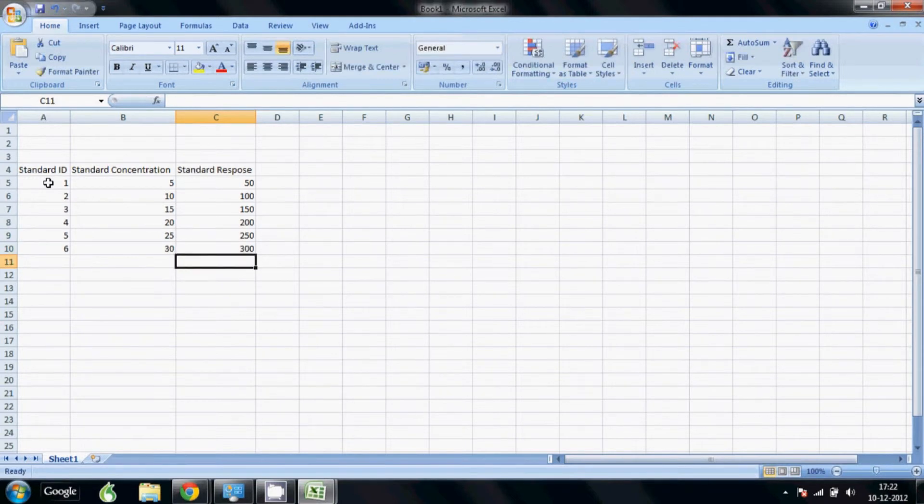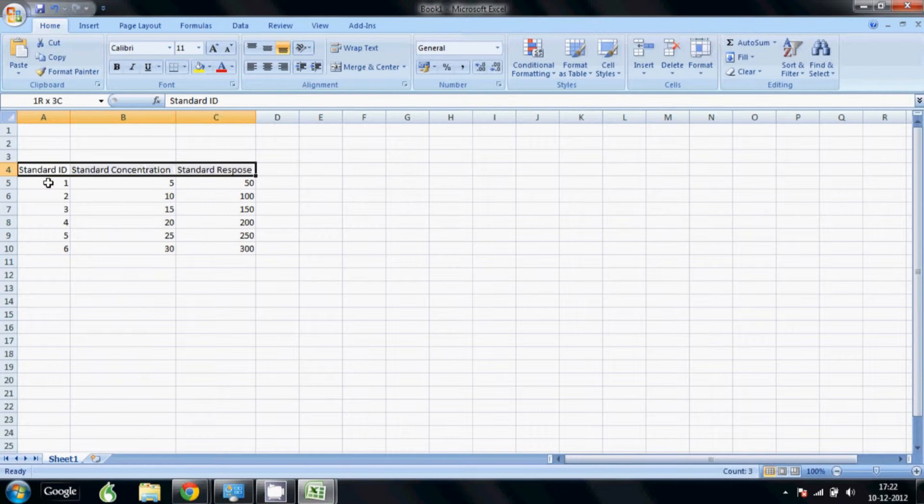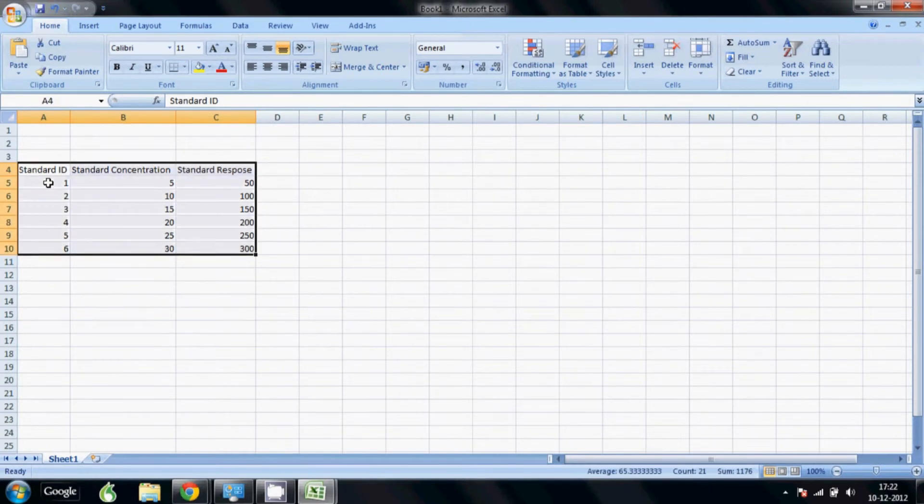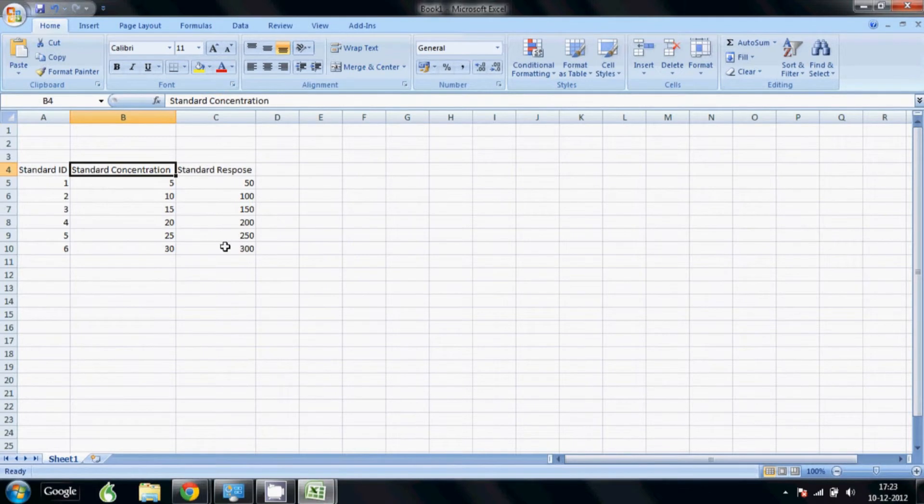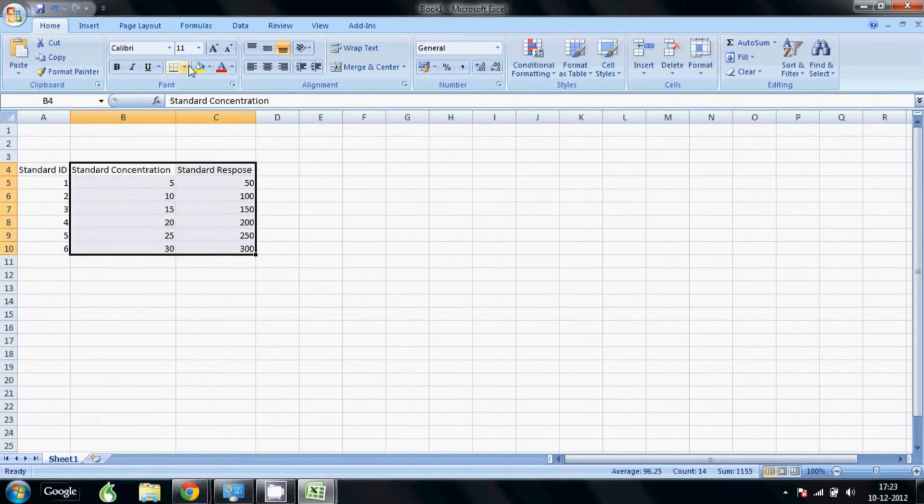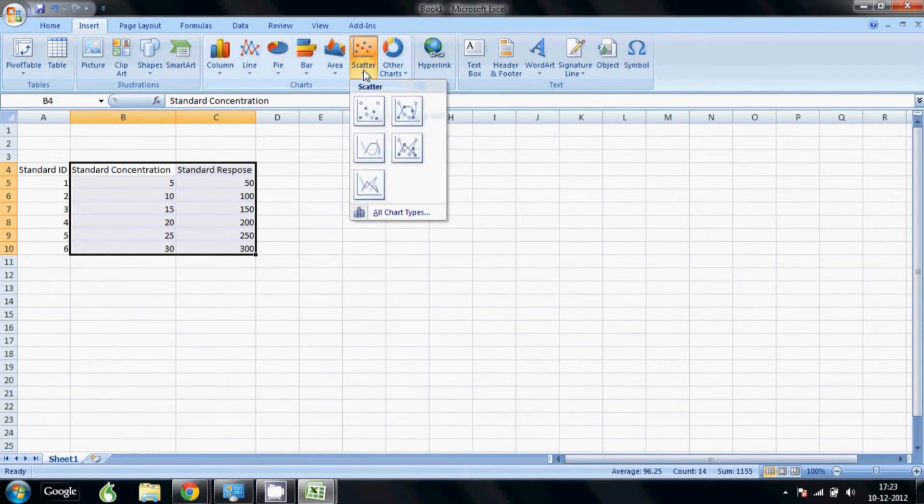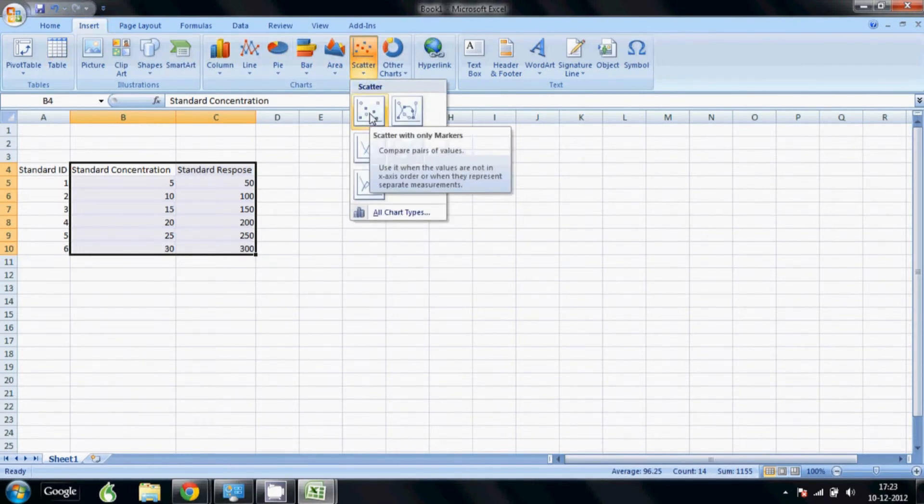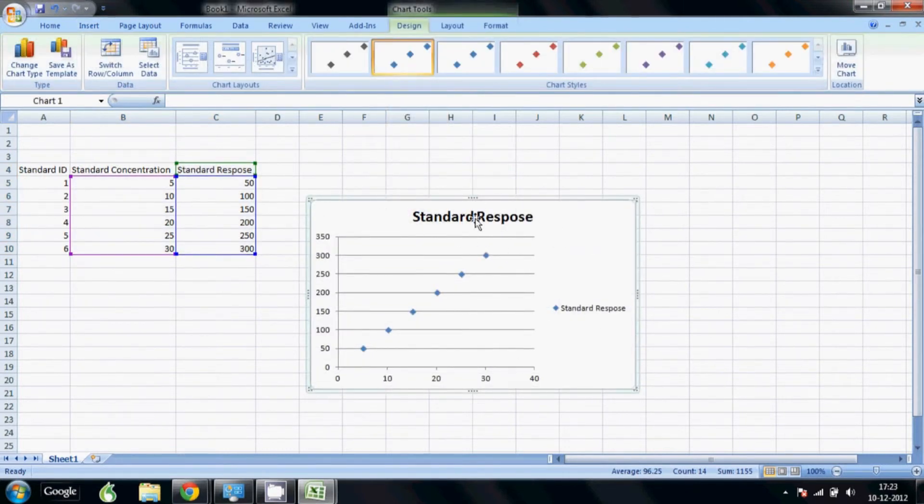All right, so now we can insert a graph for this data set. We just select the data, you click and you drag, and you go to insert and you select a scatter plot. I like using one without a line because we add a regression.